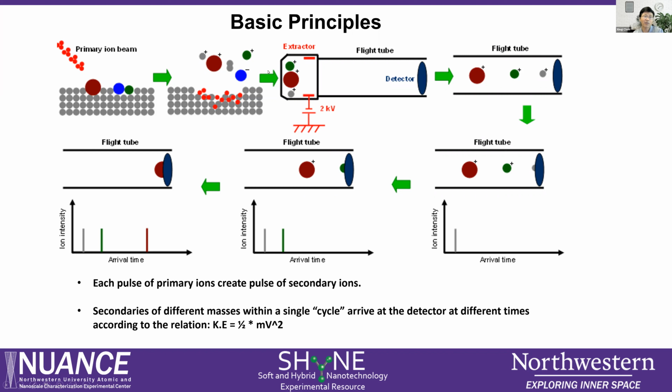Okay, this is the basic principle of SIMS. On the surface, we use a primary ion to spot, and then we generate ions: positive ions, negative ions, and neutrals. Actually, when the primary beam spots the surface, you get fragments. You get not just atoms, but some fragments bound together. So this is not all ionized. Only a small fraction gets ionized.